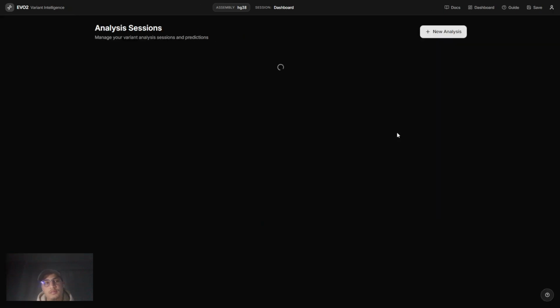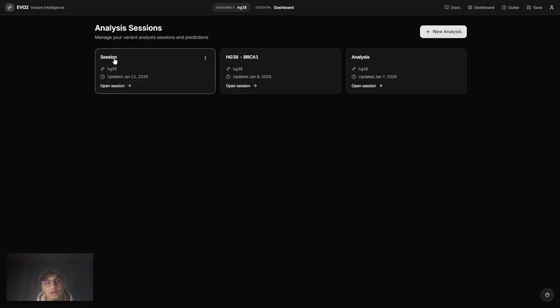And we can go to the dashboard, and we should get the session here. You can play with the prototype, and just report back to us if you're interested in extending it with other features, or if you see other areas that you want to report to us. Thank you very much.